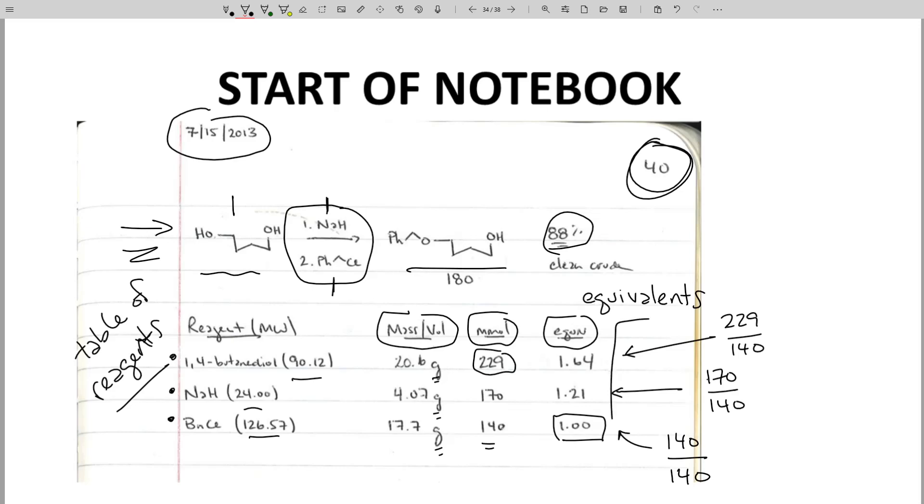I like to leave space in the margin for other information, and that might include information like molarity or density. Other factors, values that might be needed to calculate the number of millimoles of a reagent based on its mass or volume. Note that we are looking at a notebook page for a reaction that has been completed. Before you start a reaction, you complete the top of the notebook page – the date, the reaction scheme, and the entries for the reagent table. Do not fill in the amount of the reagent until you actually dispense the reagent. Too often, students will just copy the recommended amount from a laboratory procedure into their table even if they use a different amount. At best, that is sloppy. At worst, that is fraud. Make sure you write down what you did, not just what was recommended in the handout.